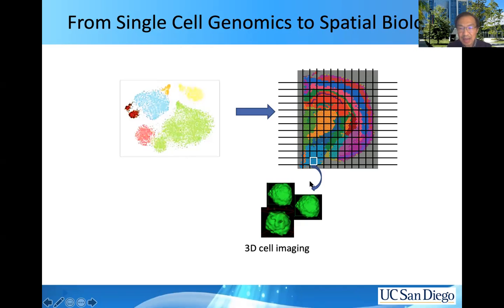Imagine we can slice a piece of tissue into very small slides. And then we will suspend the cells in solution going through a flow cytometer system that is able to produce a 3D individual cell tomography. And that allow us to put together the spatial correlations within each area.